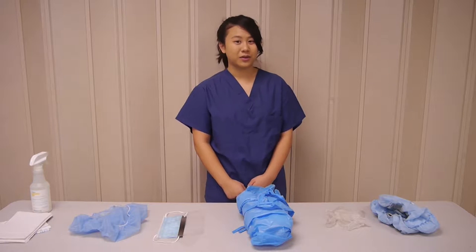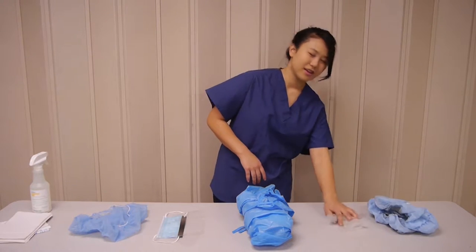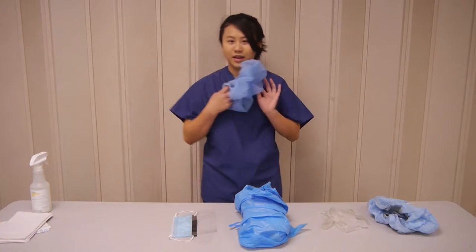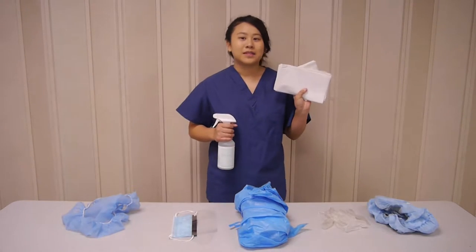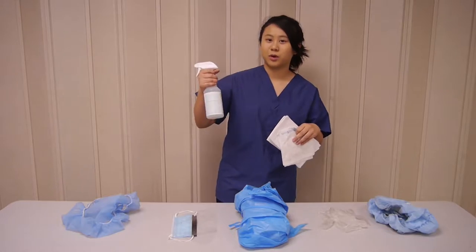Before you start cleaning your LAF hood, you'll first need to acquire all of your materials. You'll need shoe coverings, gloves, a protective gown, a face mask, and a hairnet. And to clean your LAF hood, you'll need clean wipes specifically made for this, and sterile 70% isopropanol alcohol.